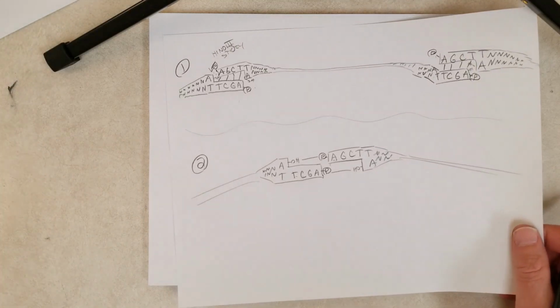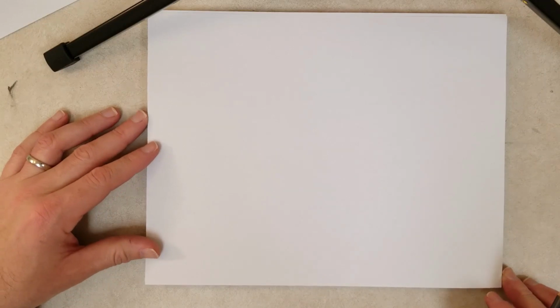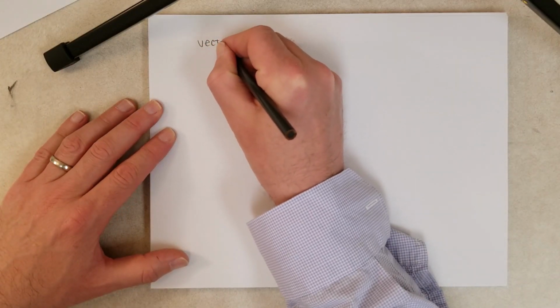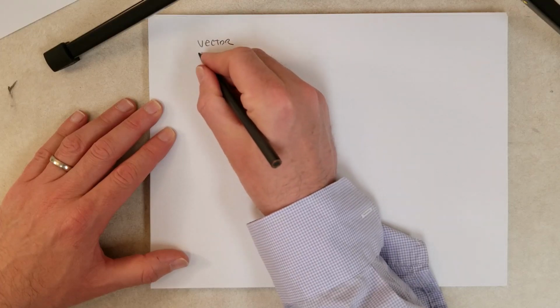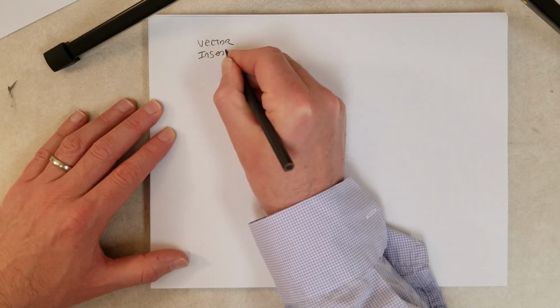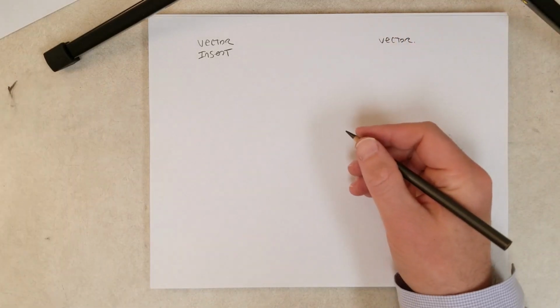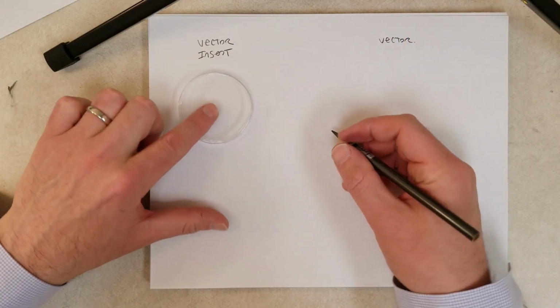So, okay, what can we do? Now this is where that LacZ gene is going to come in. Now we talked about that earlier in the video. So we have two possibilities, vector with insert and vector alone.